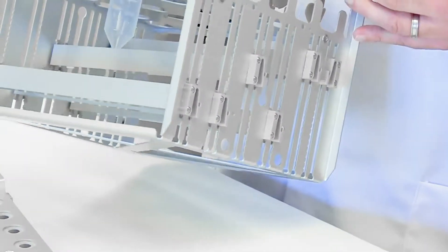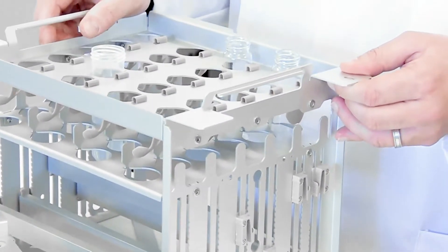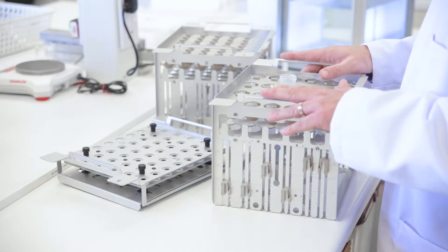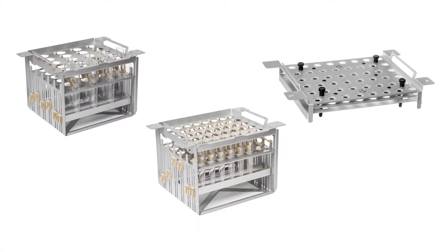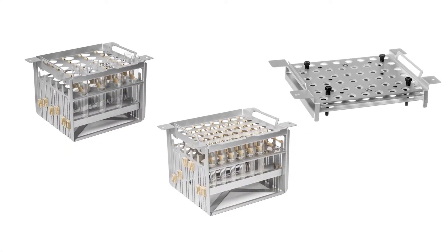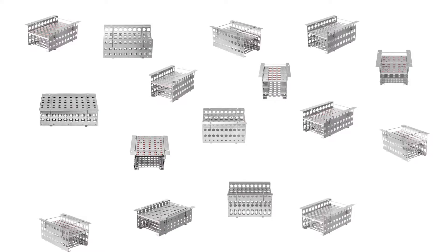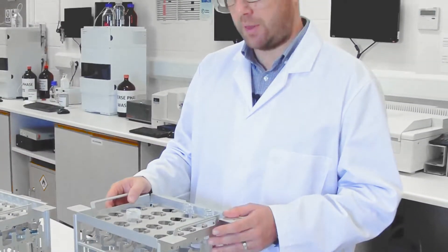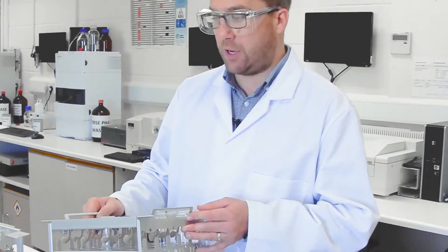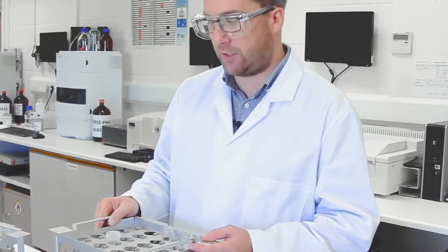I'd like to talk a little bit more about the multi-racks that accompany the system. We've got three racks that accompany the TurboVap LV, and that's all you're going to need. Traditionally on the classic system, you may have had up to 15 racks as accessory items that would allow you to deal with lots of different tube sizes.